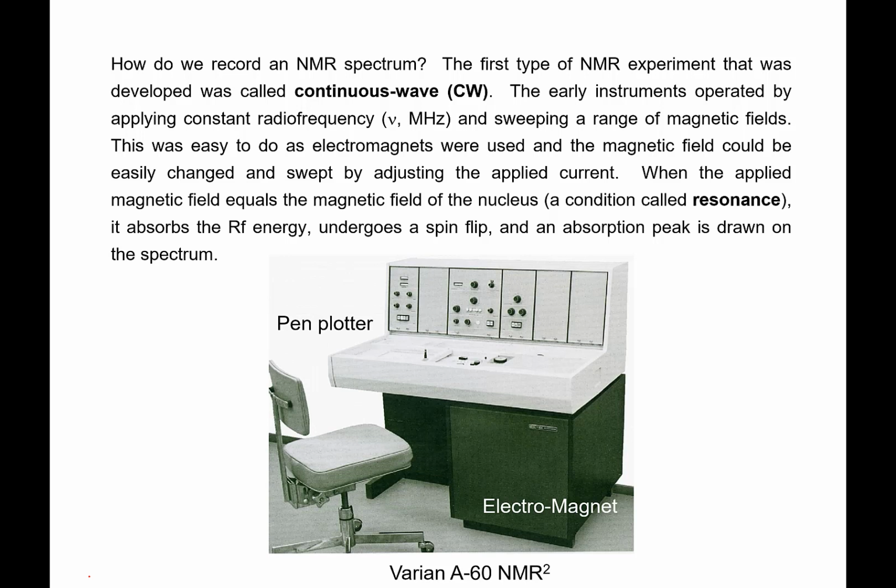I always thought we were done with 60 megahertz, that they were gone, but nowadays people buy benchtop instruments. And when the sales guy tries to sell them to me, 300, that's better than 60. You're going to sell them a 60 for $20,000, we're going to sell them one for $80,000, this for another $100,000.